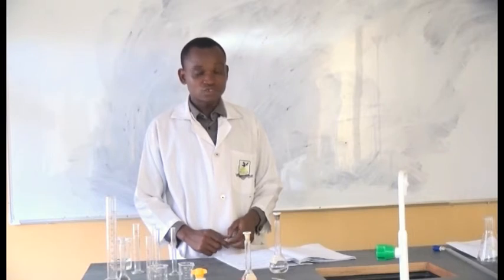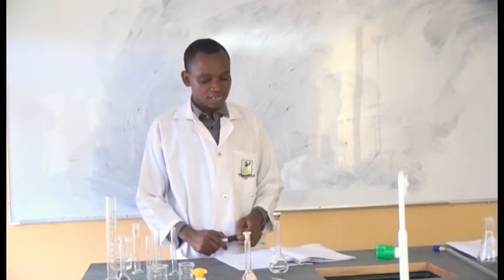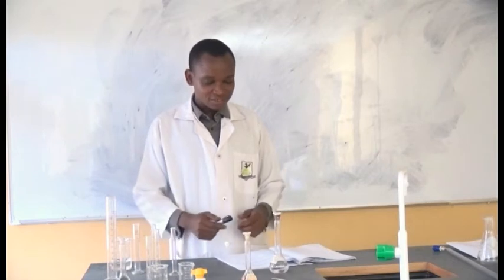In this session, we want to determine the chloride content of water. How can we determine the chloride content of water? That is what we want to look at in this section.